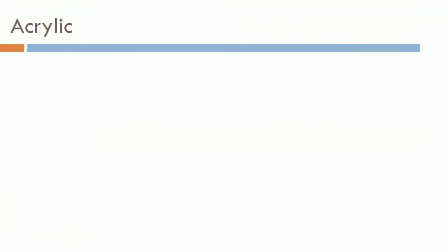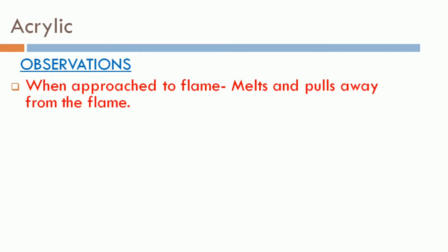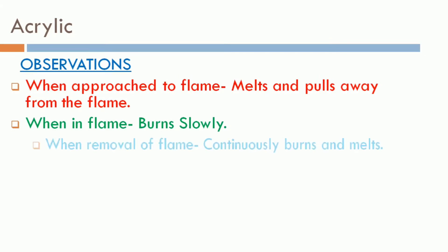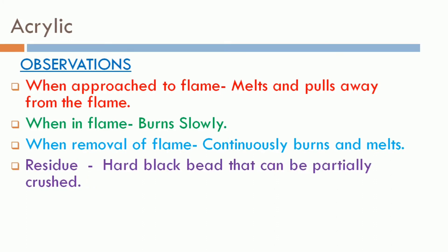Next, acrylic fiber. Observations of burning: when approached to the flame, it melts and pulls away from the flame. When in the flame, it burns slowly. When removed from the flame, it continuously burns and melts. The residue is a hard black bead that can be partially crushed. The odor is a chemical burning smell.